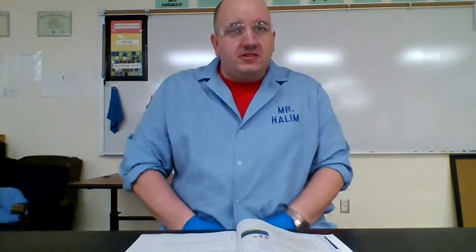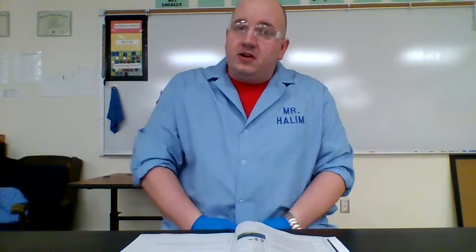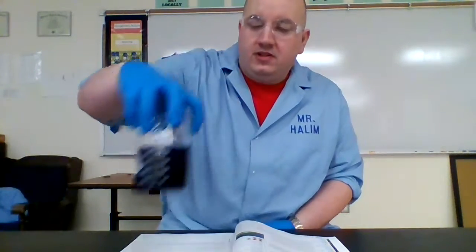So first thing we're going to do in a science lab is we're going to take our time. We're going to read the directions so that we know exactly what we are supposed to do today. So as you read over the steps, step 2, there's going to be a few things different. Mrs. DeBold and I, we've already mixed the bromethymol blue solution for you. So we already have that mixed.